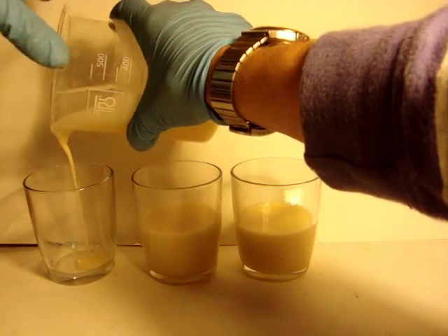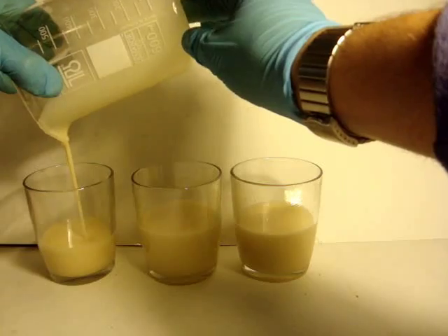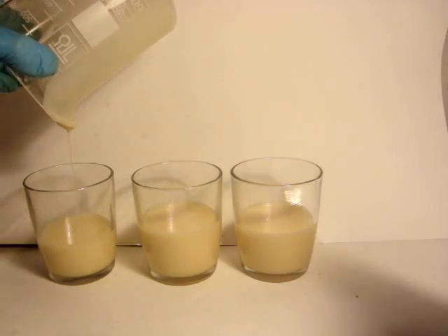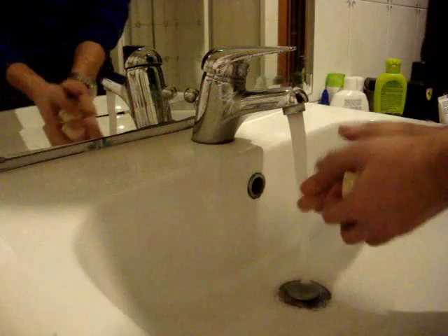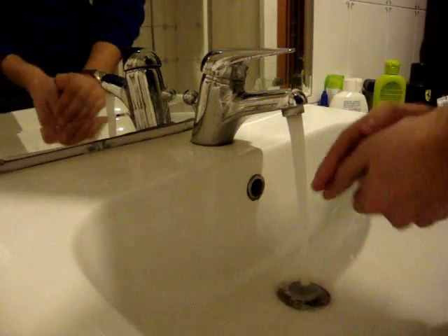Watch out — probably you don't want to wait so long, but remember: using the soap without waiting for the full time suggested could cause burns. And now you can have a wash with natural soap, extremely ecological and also self-made.